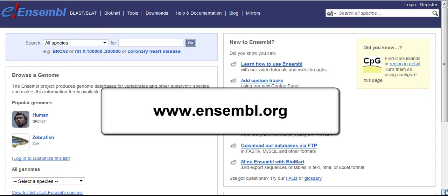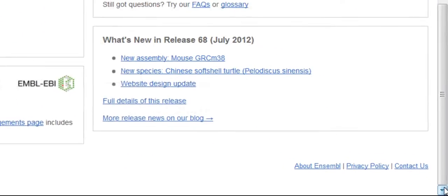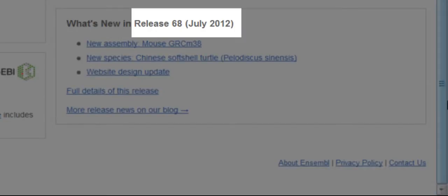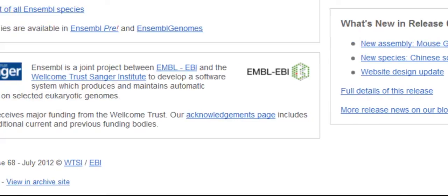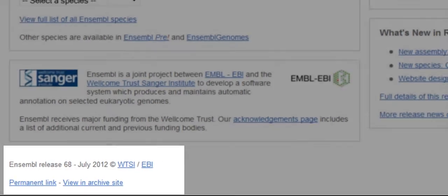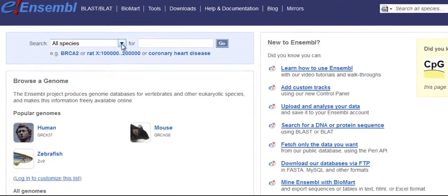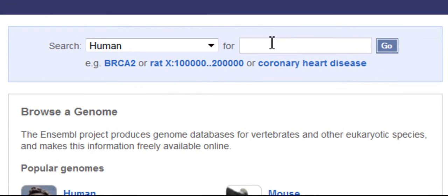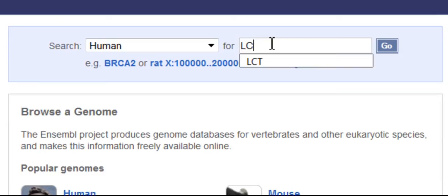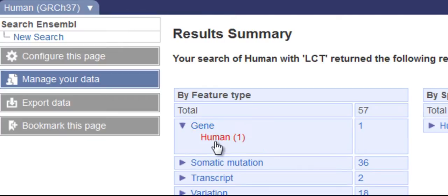This is the home page of Ensembl version 68. The Ensembl version changes every 2 months, and if it has been updated at the time you are watching this video, you are welcome to use our archive site. From the Ensembl homepage, search for Human LCT. Expand Gene, then click on Human.